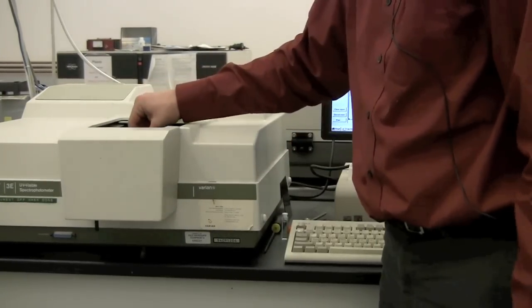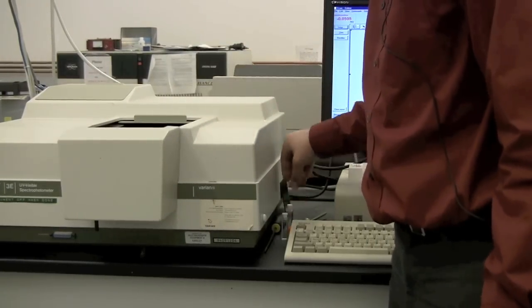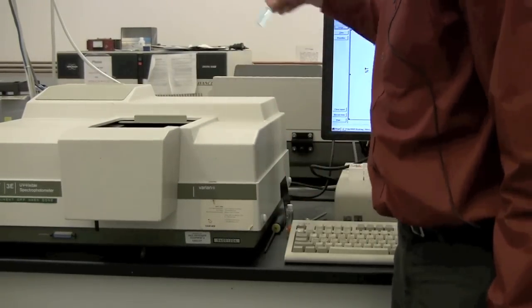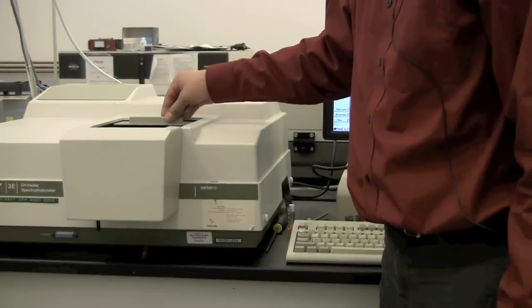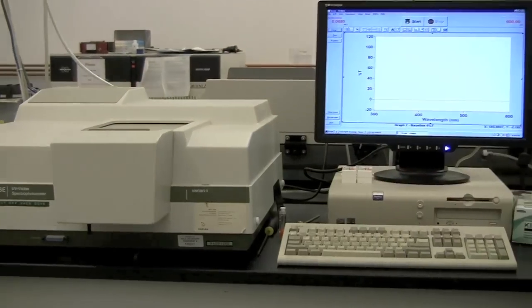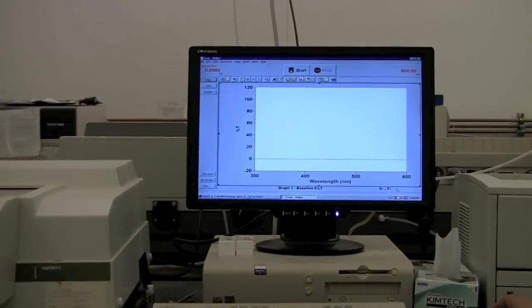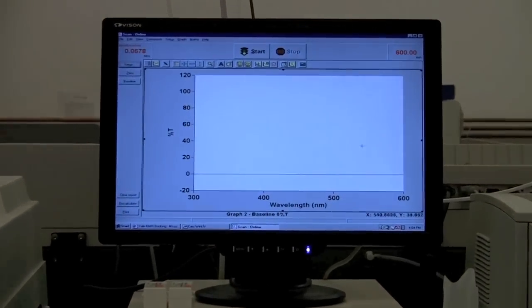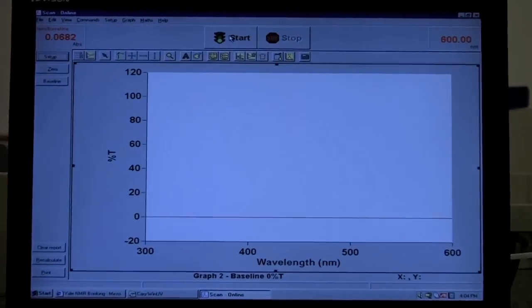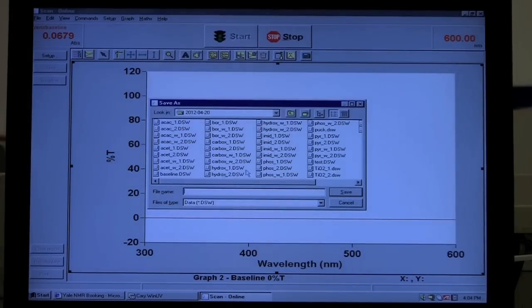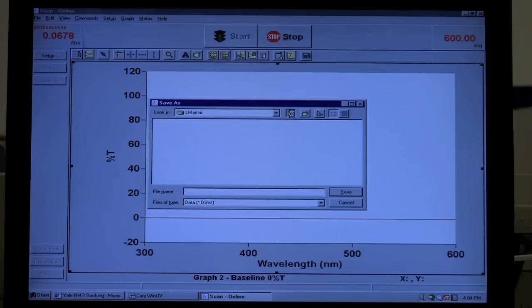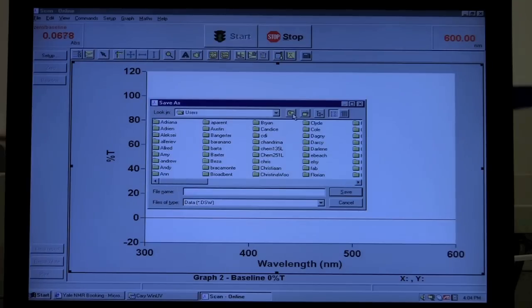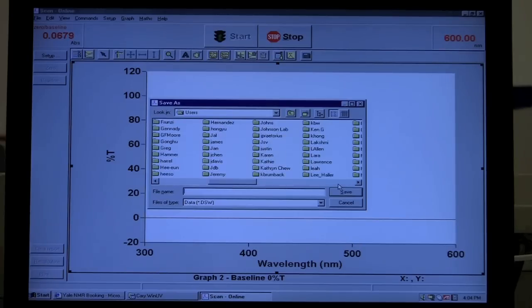So I'm going to take out this, I'm going to put in our solution of interest. And now that we're ready, we can click start. It's going to ask us for a file name. If you do not have a folder already, you should make your own folder with your username, which I will do at this time.